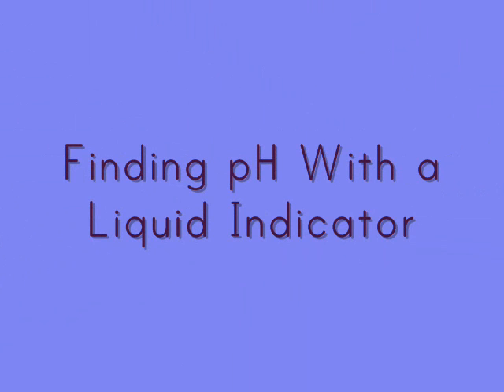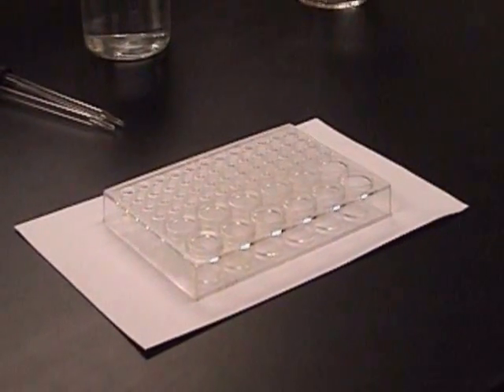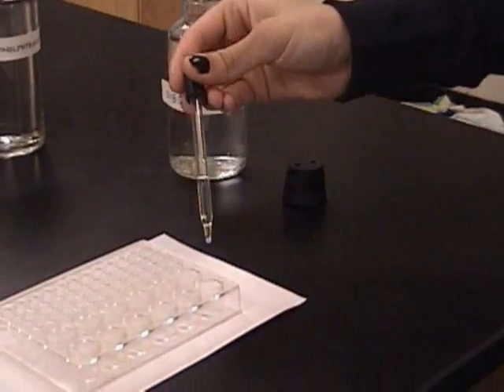Finding pH with a liquid indicator. First, place a white piece of paper on the lab table. Place a well plate on the white piece of paper. Using a clean dropper, place a dropper full of the substance to be tested in one of the wells on the well plate.